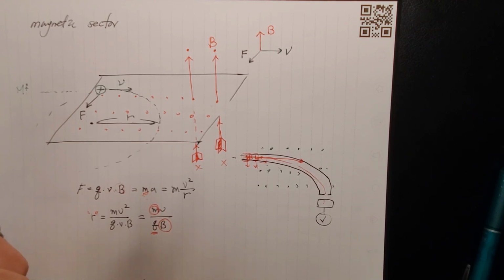But like I said, these days there are more sophisticated analyzers, but this gives you an idea how mass spec is using electric field, magnetic field, and how to detect the tiny particles' molecular weight.